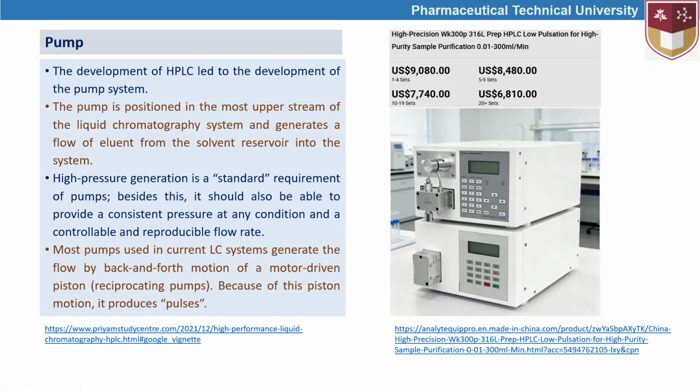The pump is positioned in the most upper stream of the liquid chromatography system and generates a flow of fluid from the solvent reservoir into the system. And high pressure generation is a standard requirement of pumps. Besides this, it should also be able to provide a consistent pressure at any condition and a controllable and reproducible flow rate.